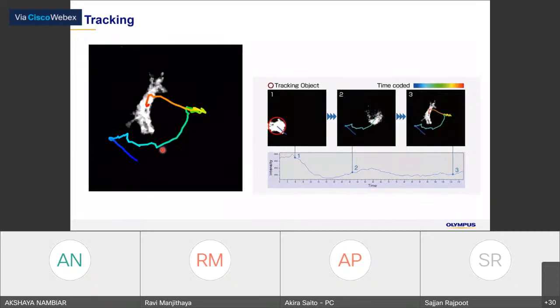Such things can also be analyzed by using tracking. So object detection and segmentation is a very key thing for image analysis, and it will be used to understand or analyze further things from the image.